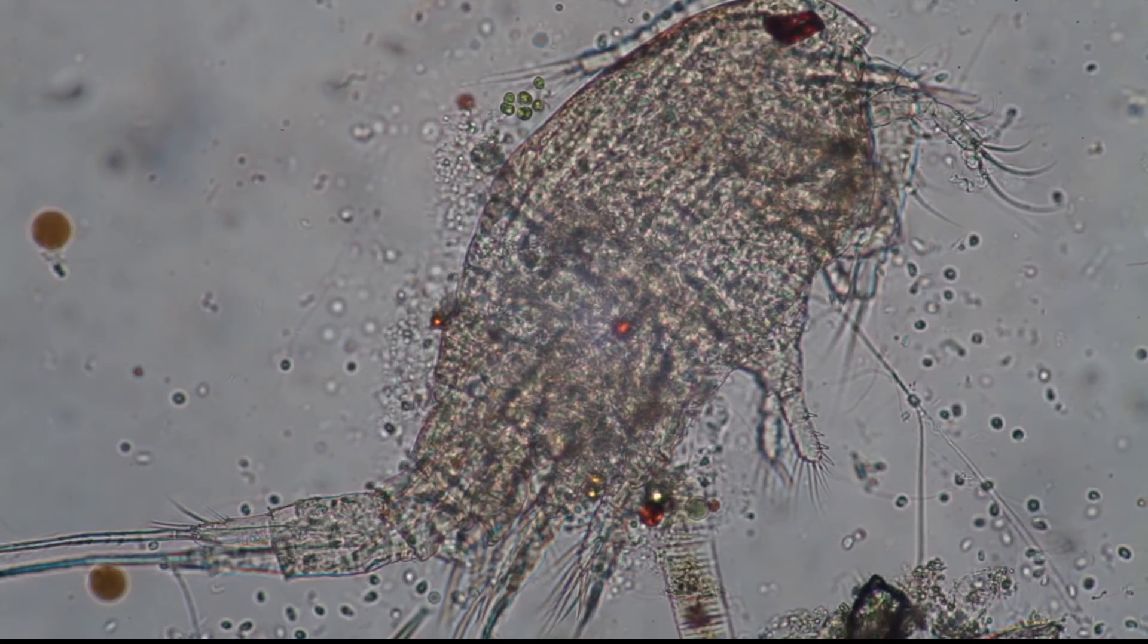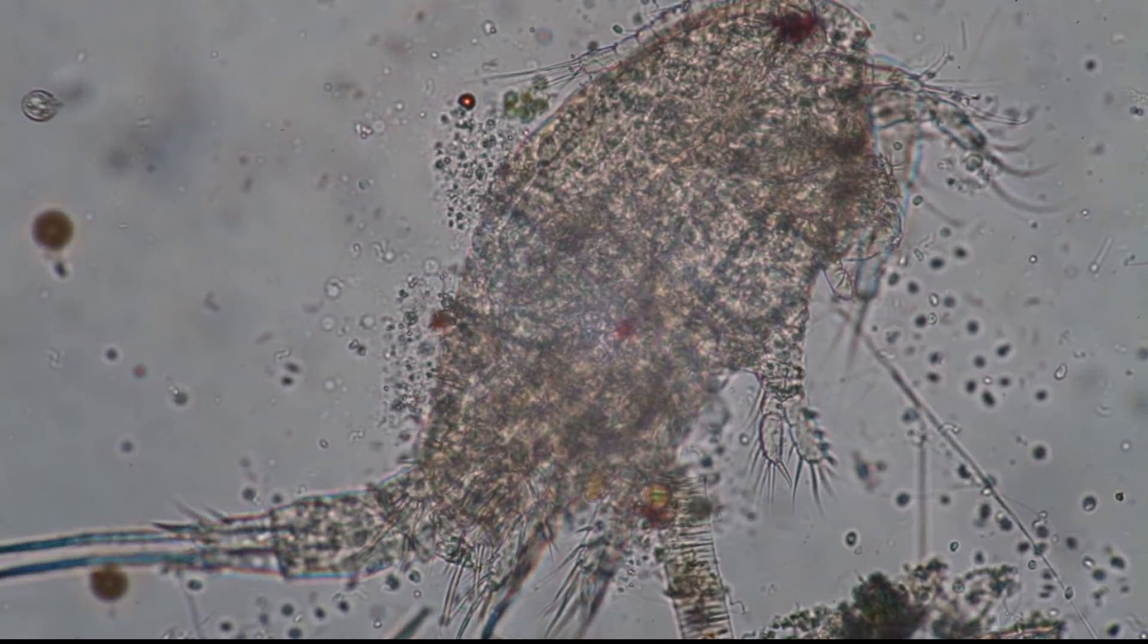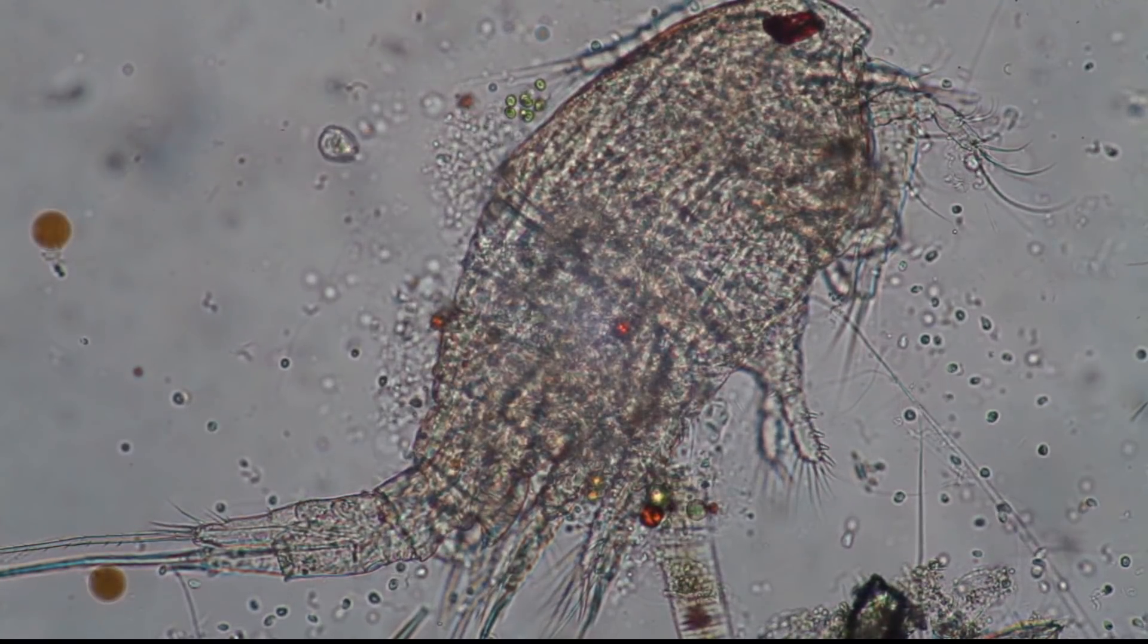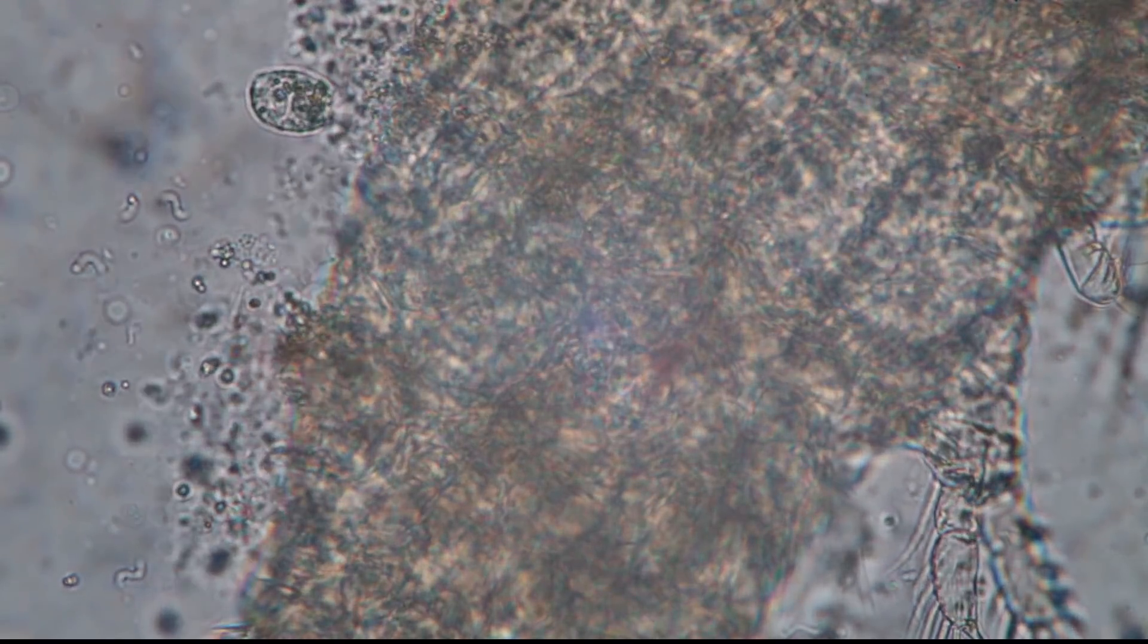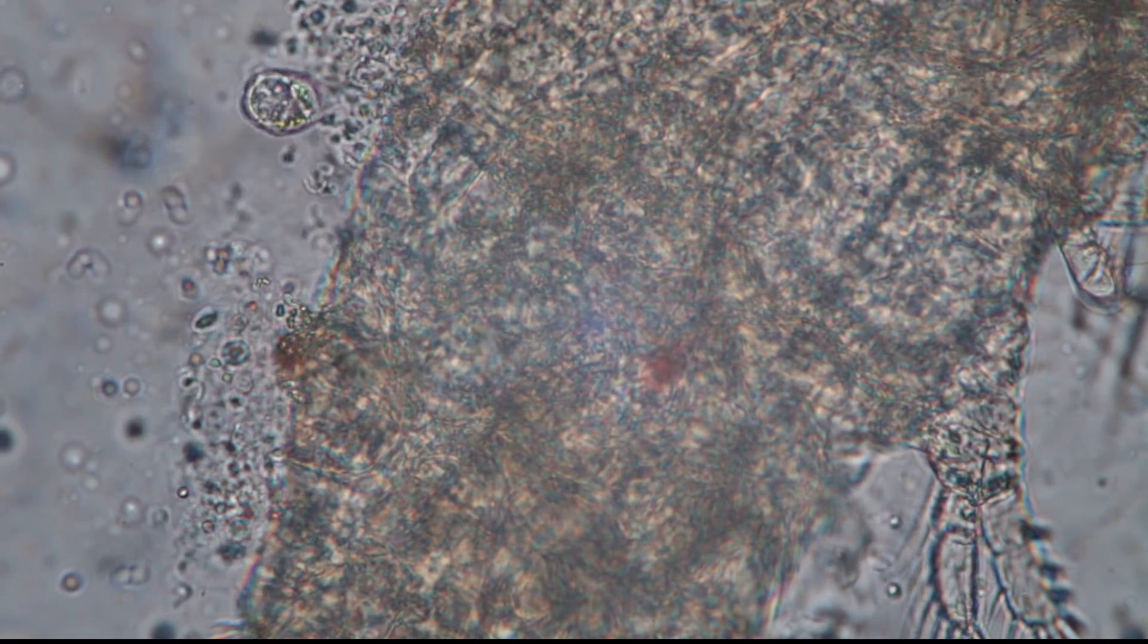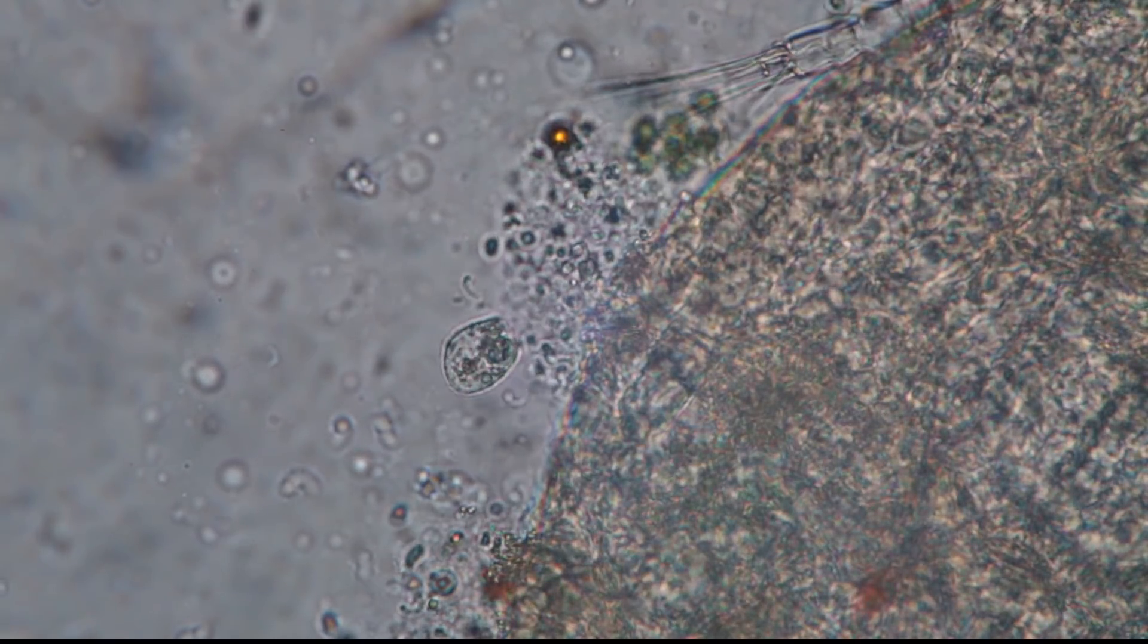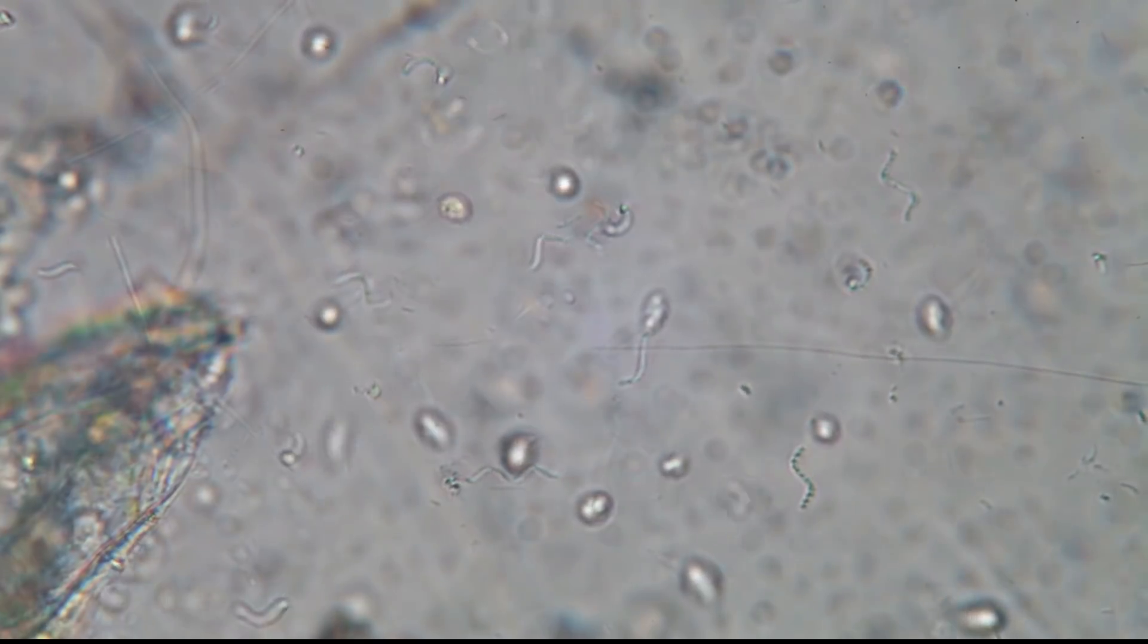Now this little crustacean already starts to look very, very ill. I think it might be a second one because this one might be the one from before because it's from the side. And you can already see that it's starting to fall apart a little bit. It does not look healthy at all anymore. Organs are not moving anymore. The spirilla everywhere. And basically what they do is they now start to decompose and break down this dead organism. So you can see that the bacteria are actually also quite important in breaking down and decomposing organic material. In that sense, they play also a very important role in recycling nutrients in the environment.